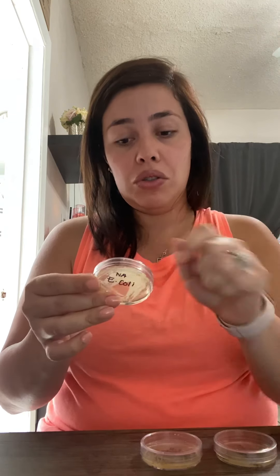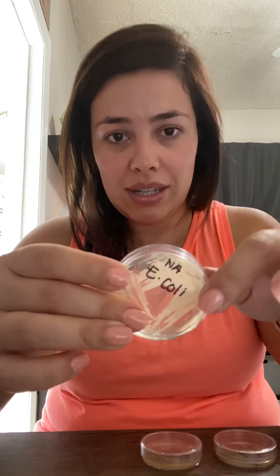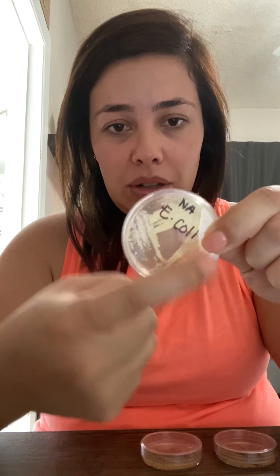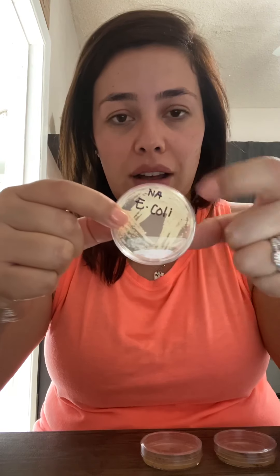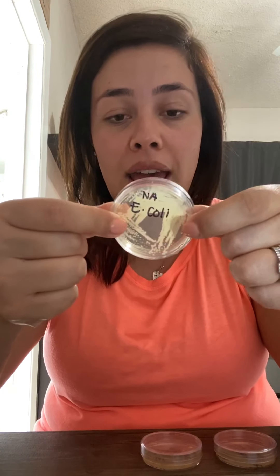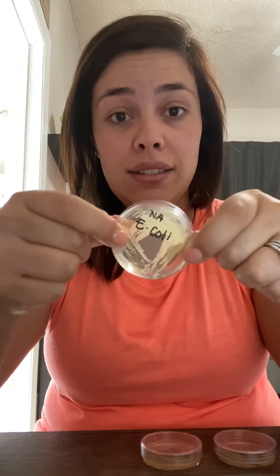As you can kind of see down here, we have three different cultures that we smeared. Using inoculation loops, we went ahead and created smears of the cultures. You can see how we utilized the four quadrants of the petri dishes, and these actually had to incubate for a couple of days.